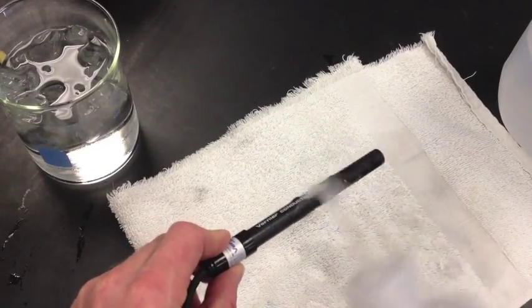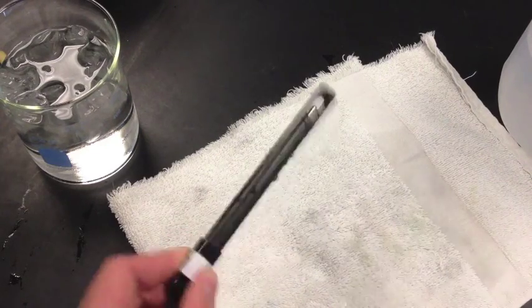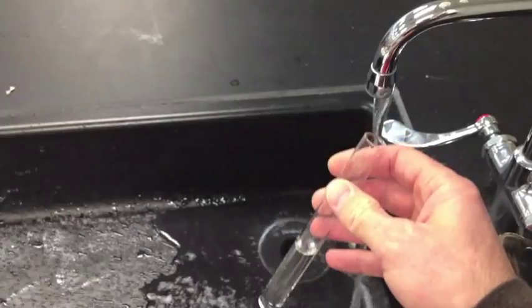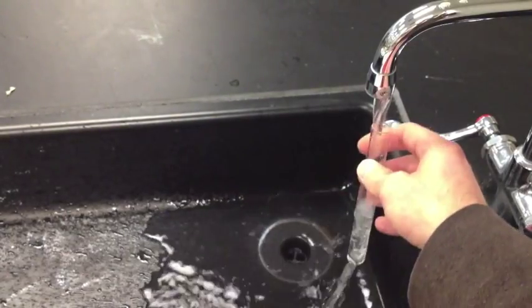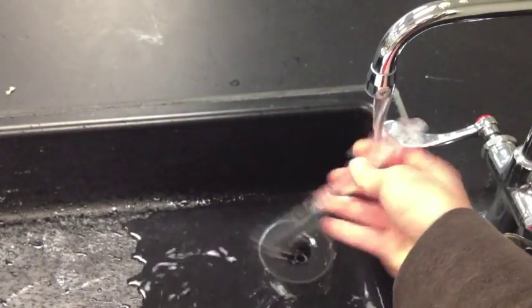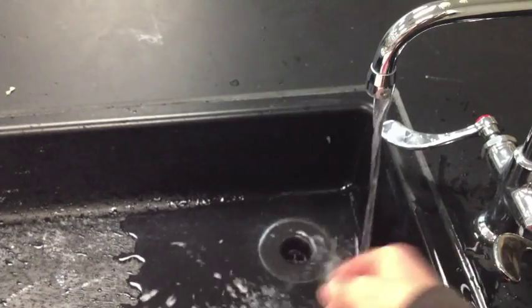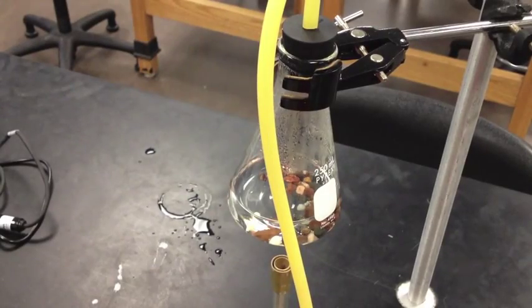Clean up: rinse off your conductivity probe one more time and dry it off before putting it away. Rinse out test tubes and beakers — I recommend rinsing them thoroughly at least five times to remove any salt residue. Allow your Erlenmeyer flask to cool for a long time before you touch it. Please take your time cleaning up lab equipment, rinsing off glassware, and spraying off your table.